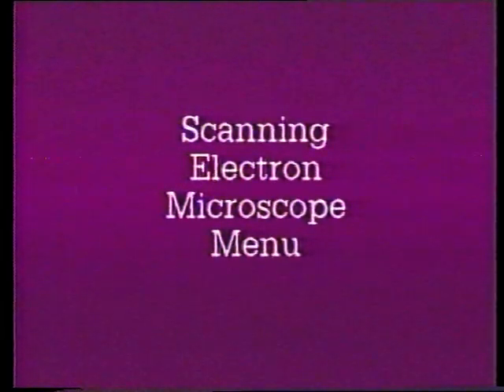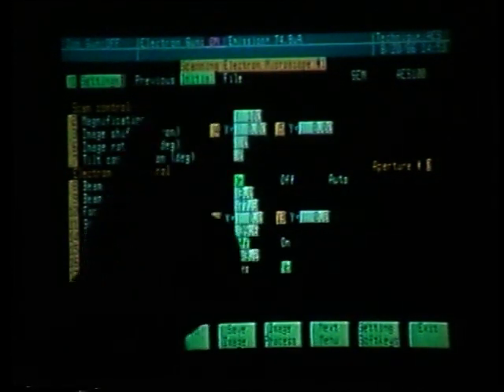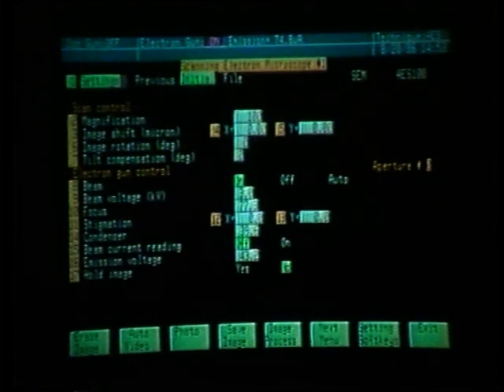Now that we have the proper ion gun parameters, let's return to the computer and set up the electron gun for Auger depth profiling. To locate an area on the sample, we used our initial settings for the scanning electron microscope, those settings being 3 kV and a magnification of 100x. We were then able to locate the sample on the sample holder, also locate a spot on the sample, and then find the focal point of the analyzer using the align routine.